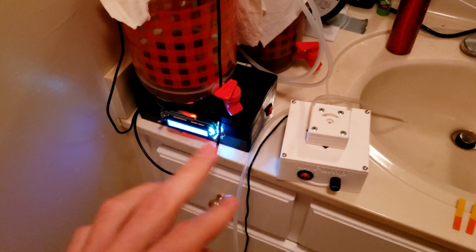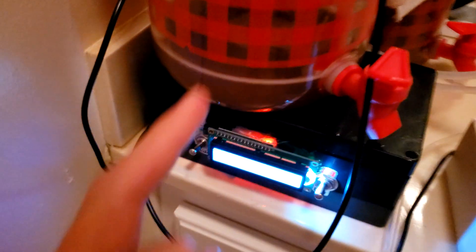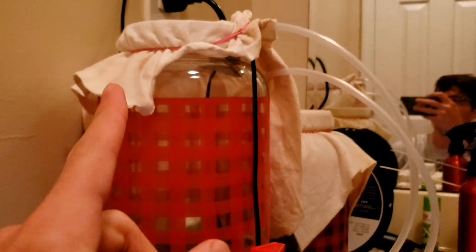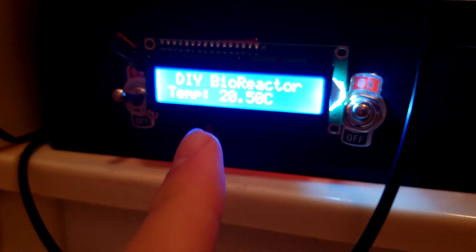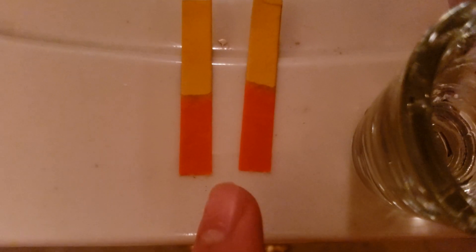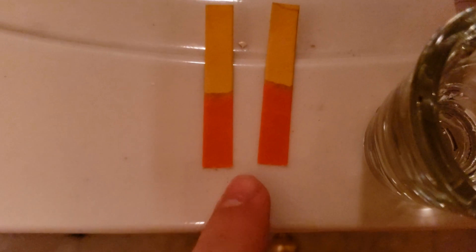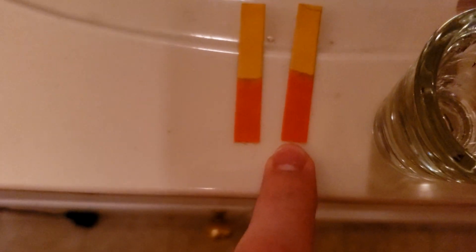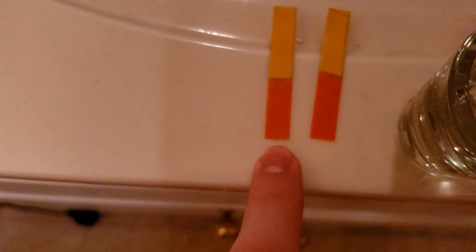Okay. So it's been about 24 hours and everything is still running. The stir bar is still going. It did stop at one point, so I had to move it around a little bit, but it's running fine now. The air pump is still going. Temperature is still working well. And I took a little sample of both of them. I didn't really expect the pH to be much different. Here are the results that we got from that. You can see they're almost indistinguishable. Which one is which? This one is from the batch and this one is from the bioreactor setup.